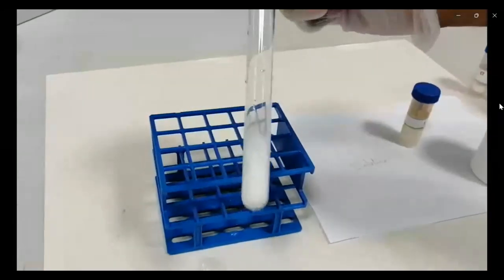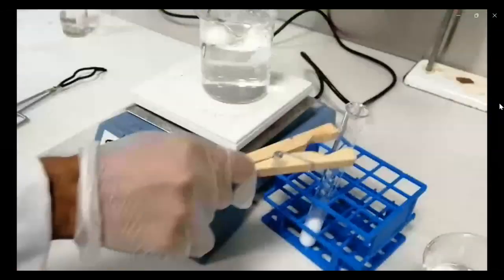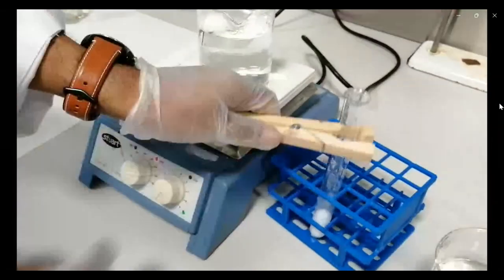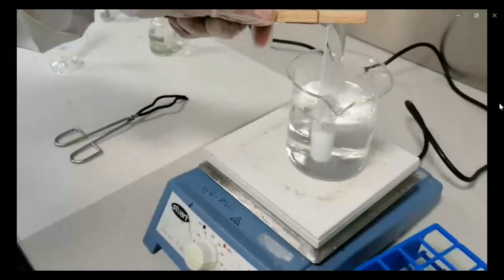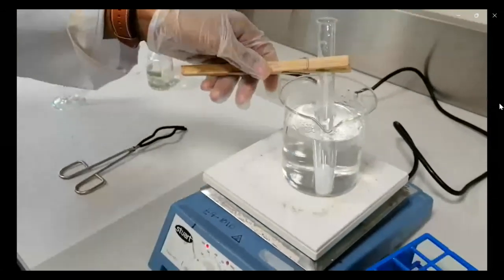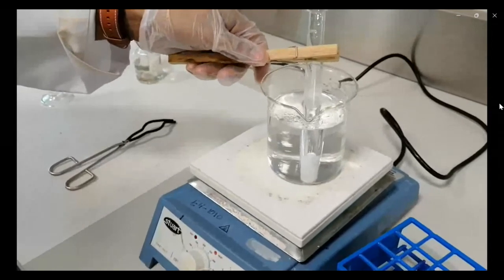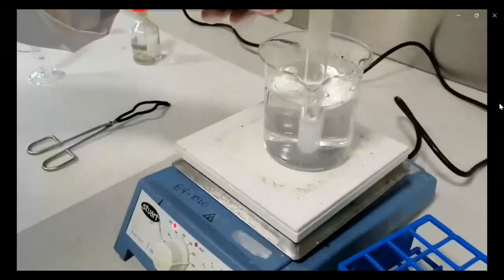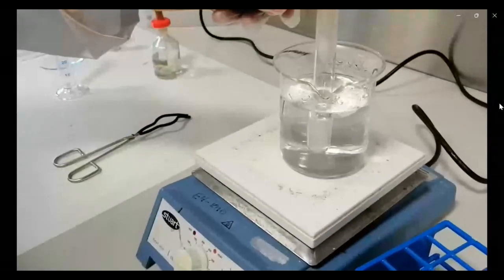Can you see that white precipitate? It's very clean. And this precipitate is soluble in hot water. So we're going to put it in a water bath, and you will see later on this white turbidity disappearing.